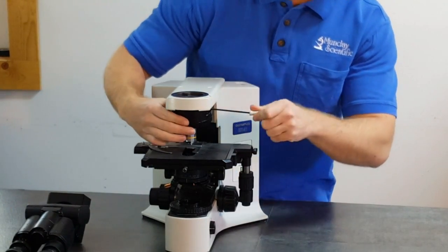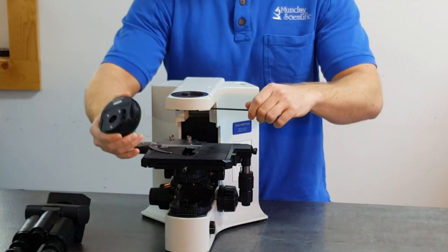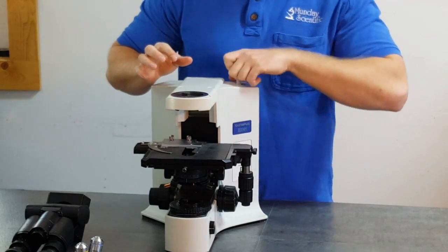Next, you want to take the nosepiece off, which contains the objectives. It's two turns and the nosepiece comes right off. Put the wrench back.